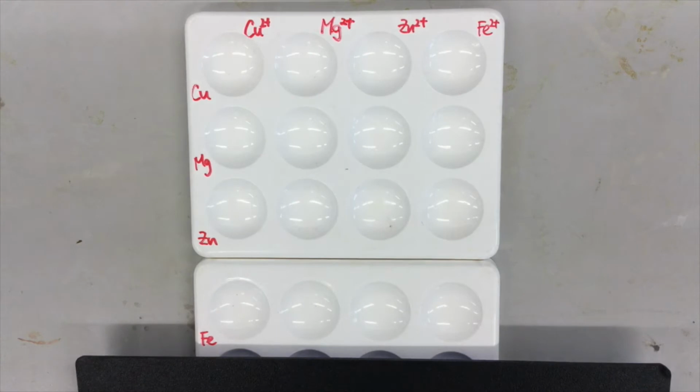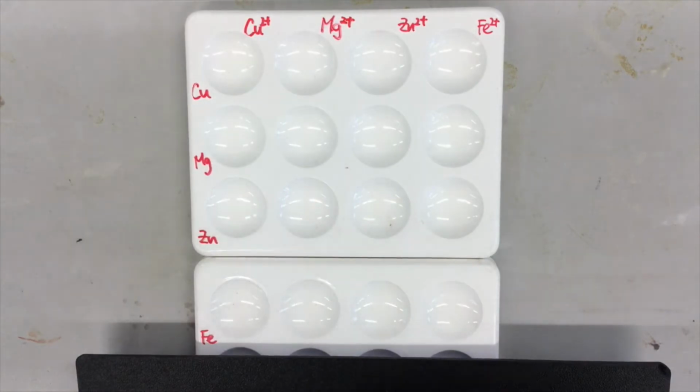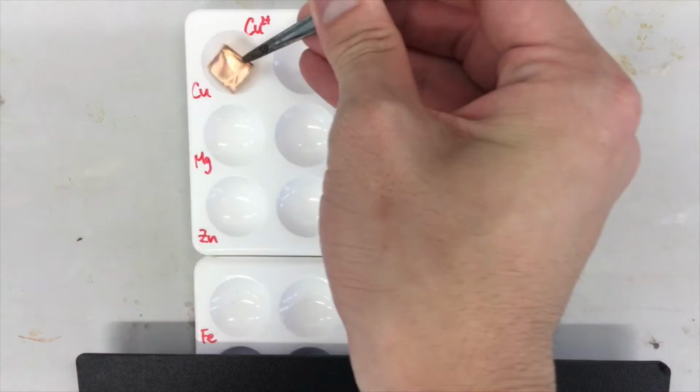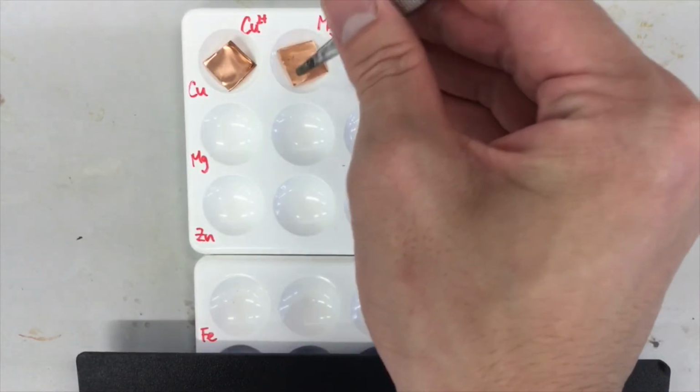In this experiment, we are going to compare the reactivity of four metals, namely copper, magnesium, zinc, and iron, by performing displacement reactions involving metals and the metal compounds in aqueous solutions. We are using two 12-well plates to form this 4x4 setting. On the horizontal row, we are going to put the four metals, and on the four vertical columns, we are going to put aqueous solutions containing the respective ions.